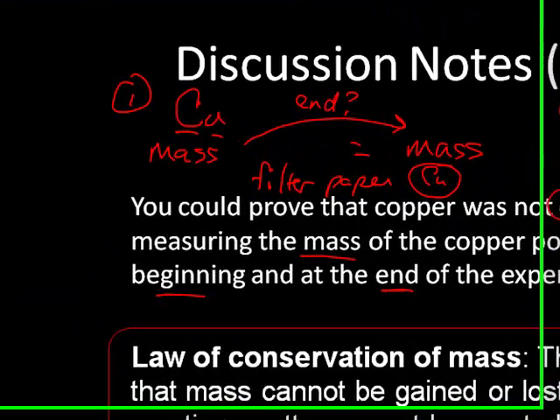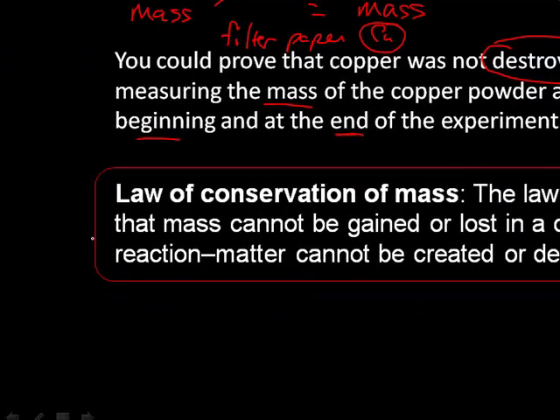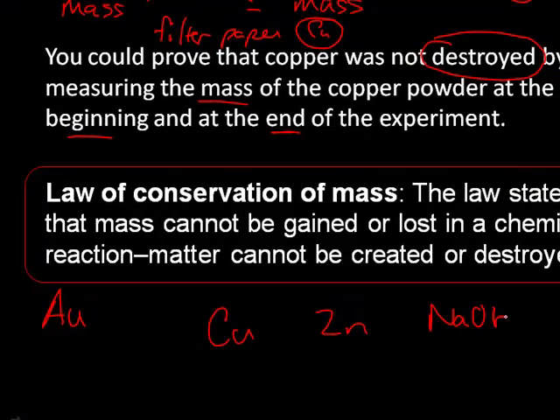Now, in our penny activity, the observations in this copper cycle lab prove evidence that the golden penny is not gold. If the golden penny were gold, it would have to have had gold somewhere in it. We had copper in it, we added zinc to it, we had sodium hydroxide, and none of these are the element gold.